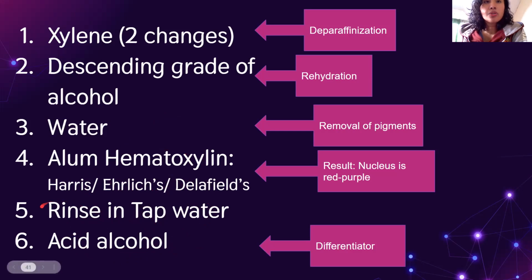So it's a differentiator. There is here water, so that the alcohol will not contaminate your hematoxylin. Class, as time goes by, pwedeng ma-dilute tong hematoxylin mo kasi nalagyan mo ng water, kung hindi mo tinap off yung water, or pwedeng malagyan ng alcohol. Ito, nirinse mo naman ng tap water, so pwede mo ma-dilute itong acid alcohol because of the excess water from the rinsing. So you have to completely tap off the water, kundi nadadilute mo yung mga reagent mo.